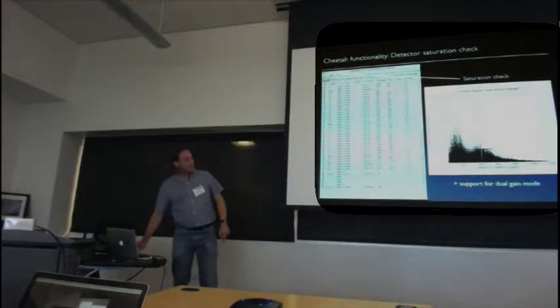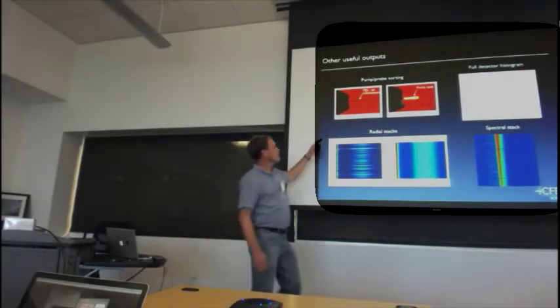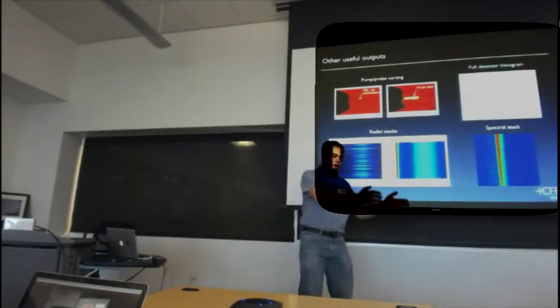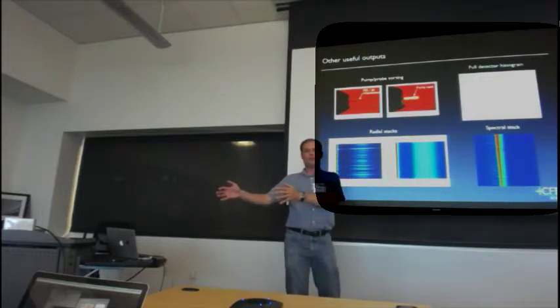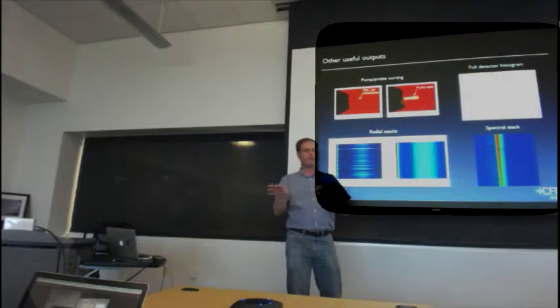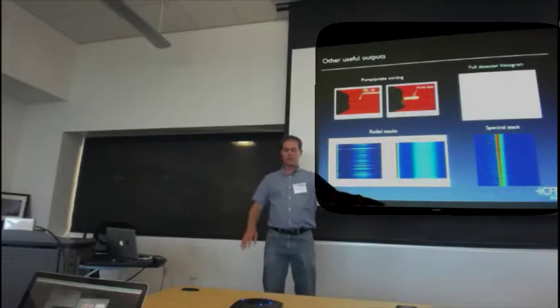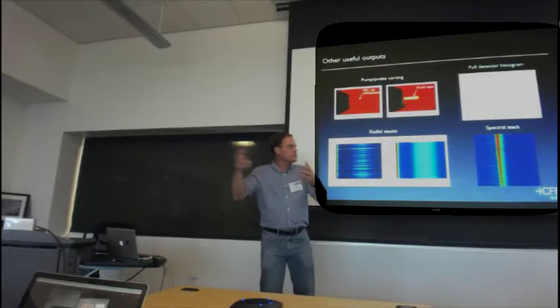You know, there's a bunch of other stuff that goes on as well, like we've done pump laser on and off, and you want to then, of course, sort by here the ones with the pump laser on, here the ones with the pump laser off. So you write into Cheetah a little bit of a sorting thing according to some criterion that creates two piles of data that you can then analyse separately. Just basically two file lists, just says these are the ones with the laser on, these with the laser off. Or you can write your own sorting routine there.